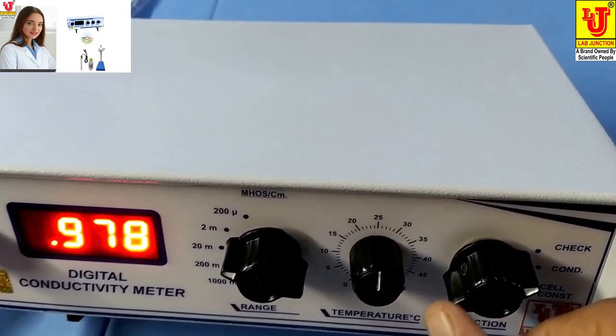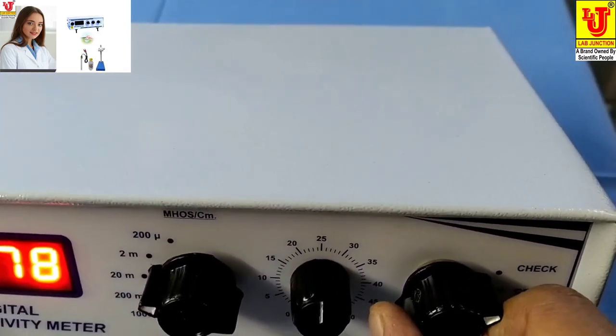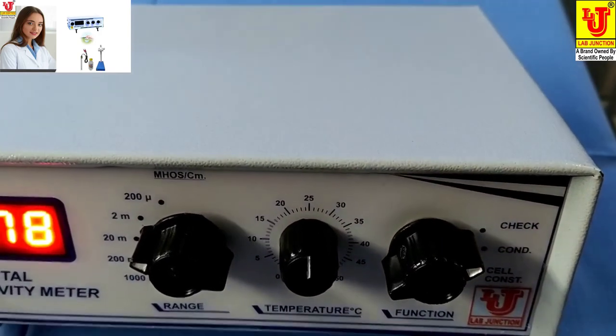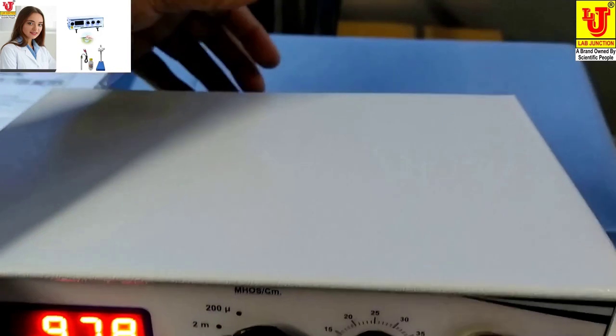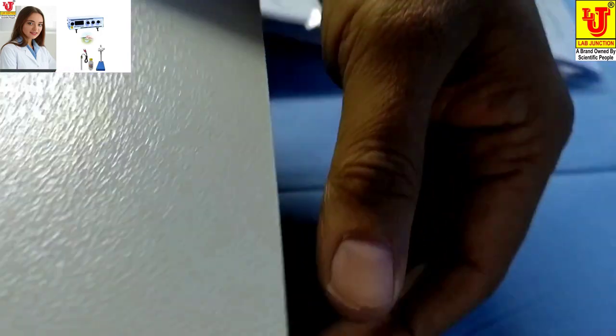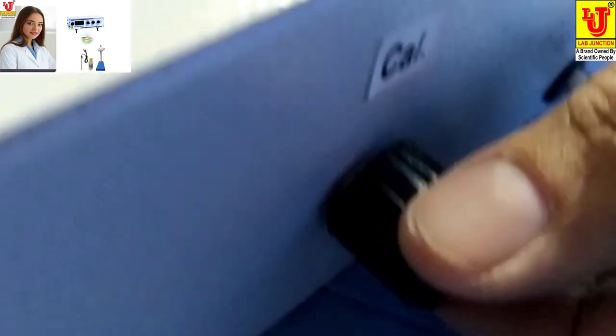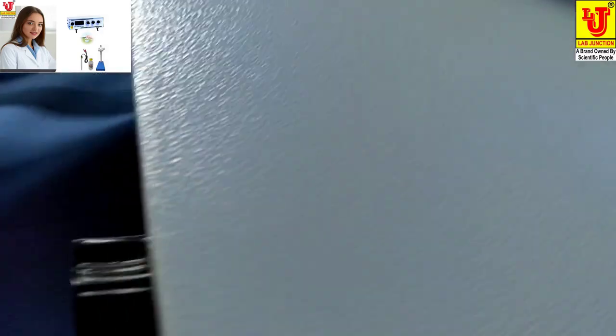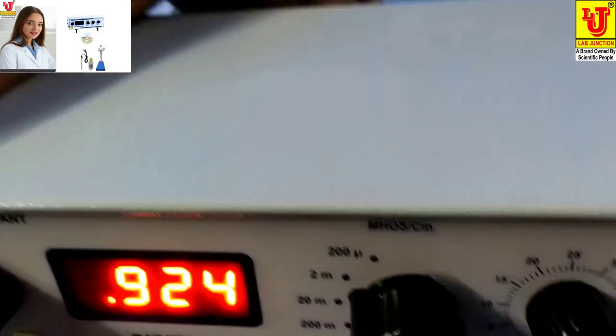First you have to do function control on check position like this. On the back side, one Cal knob is there. You have to set 1.000, all zero.